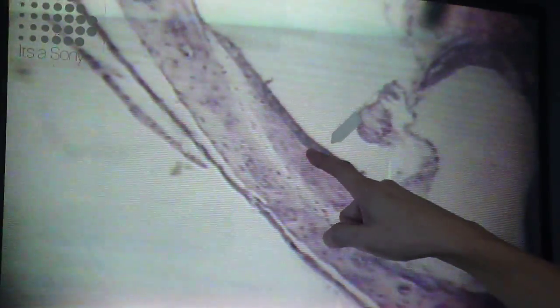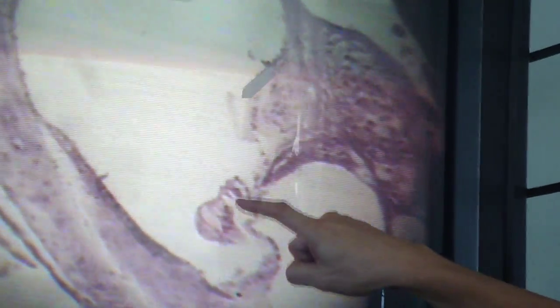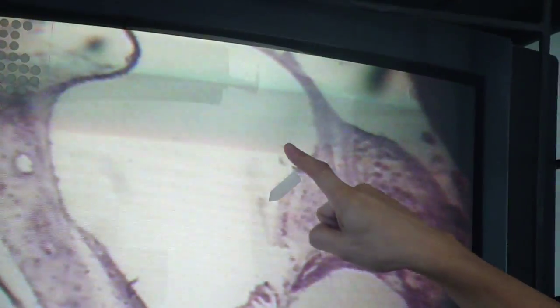So what are you supposed to identify in the cochlea? You have your spiral ganglion, cochlear nerve, modiolus, spiral lamina, spiral limbus, spiral ligament, stria vascularis, organ of Corti, basilar membrane, vestibular membrane, interdental cells, hair cells, tectorial membrane, perilymph in the scala vestibuli, endolymph in the scala media, perilymph in the scala tympani. And if you go up, there is a communication between the two, which is called your helicotrema. The communication of the scala vestibuli and the scala tympani.